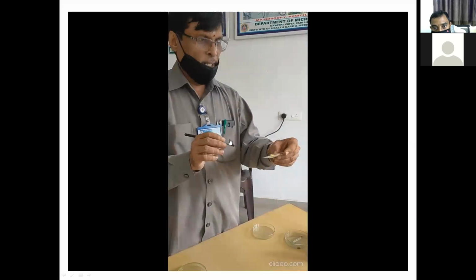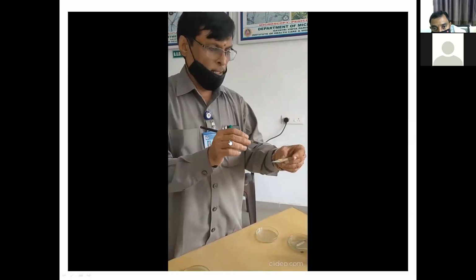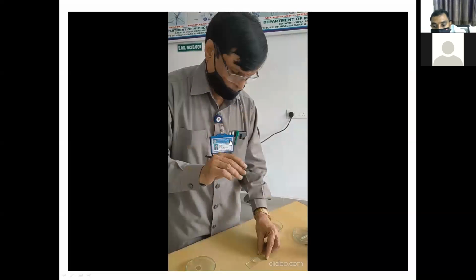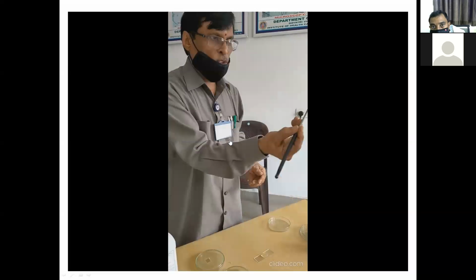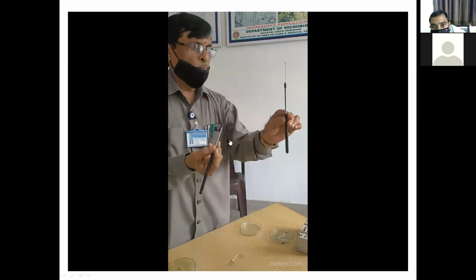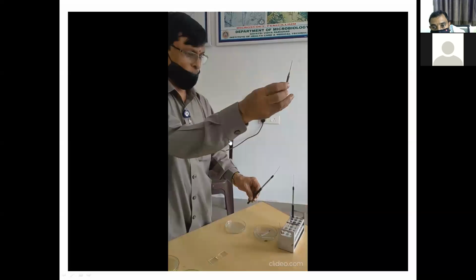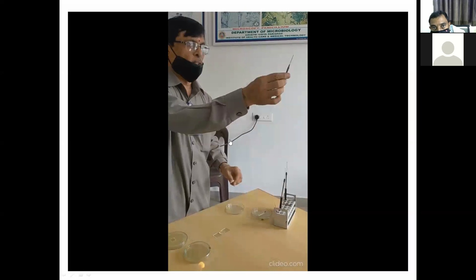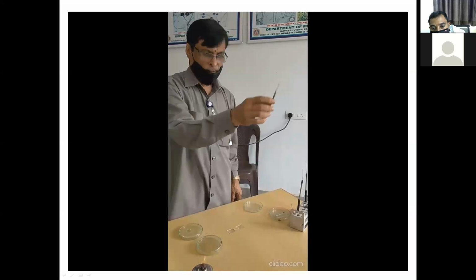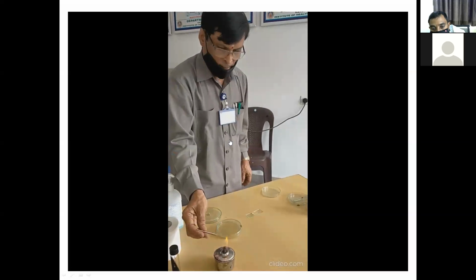First a sterile slide, over it a centimeter square Sabouraud dextrose agar piece, over that the cover slip. Now with a straight wire, this is a loop, we don't want that, this is the straight wire, or a teasing needle, which we used in the intermediate biology practicals. Then sterilize this teasing needle.